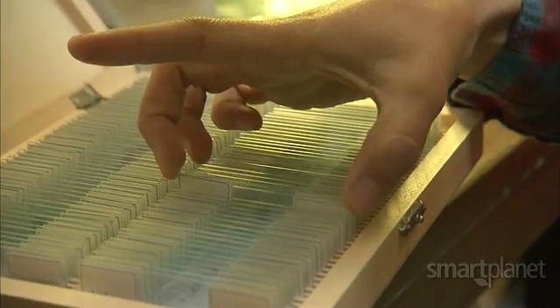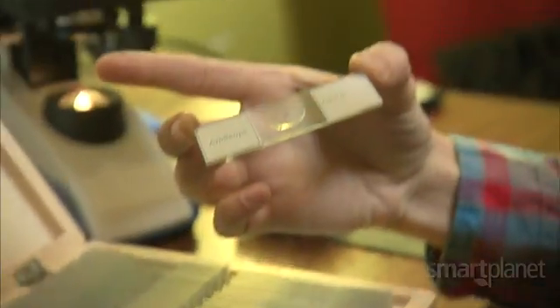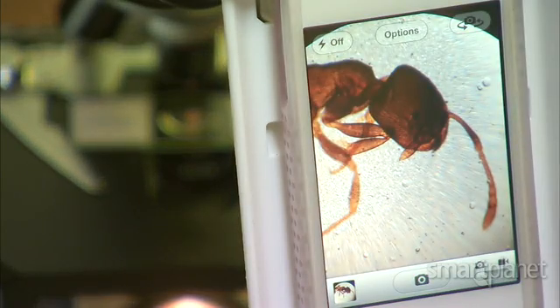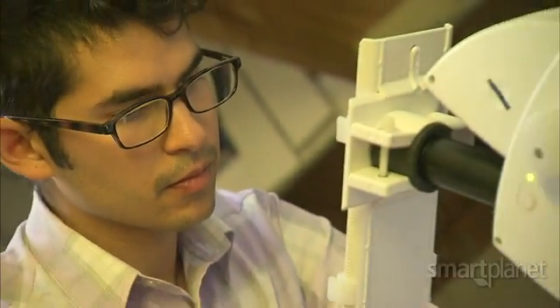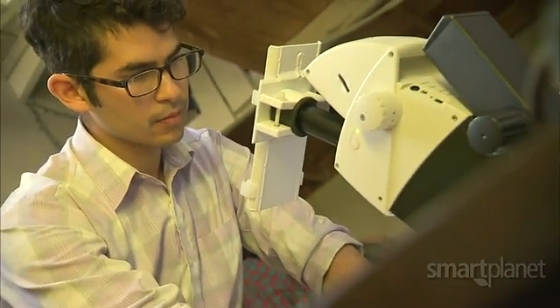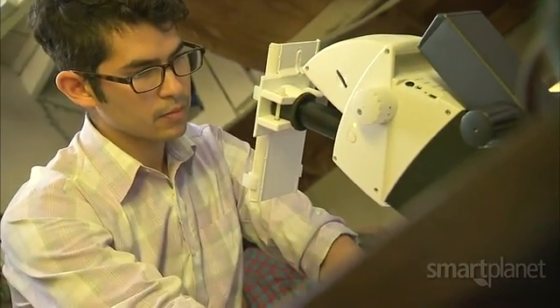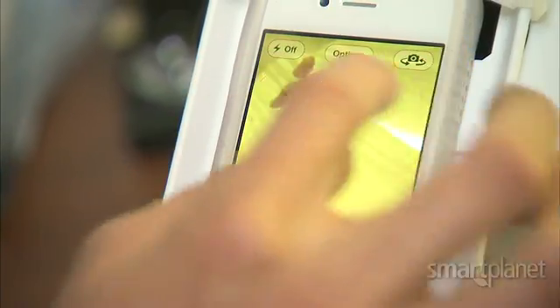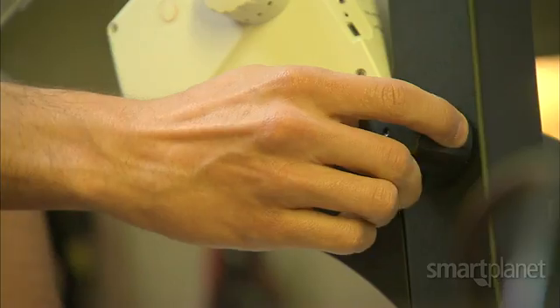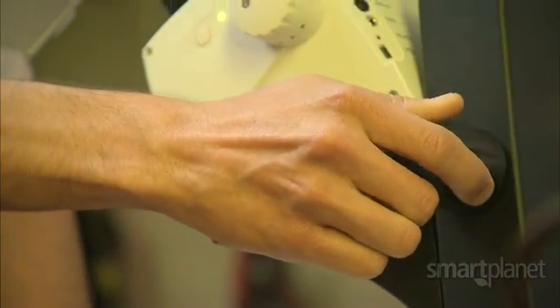With the smartphone's camera and internet connection, users are able to capture microscopic images and transmit them via email or on the web. Miller says they've tested the mount on hundreds of microscopes and smartphones, and adds anyone can use it, whether you're a student or a scientist.